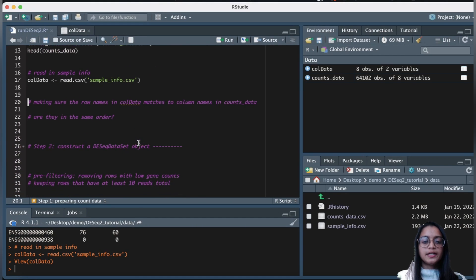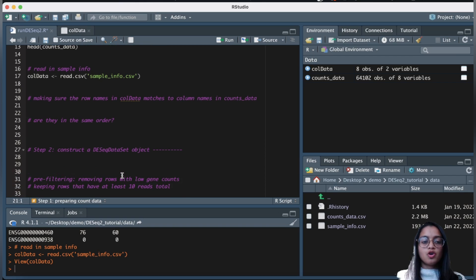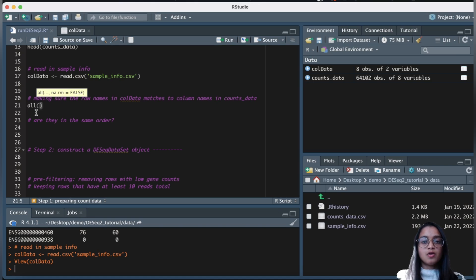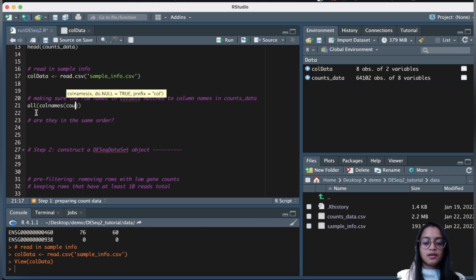Before we create a DESeq dataset, we have to make sure that the column names in our counts data match with the row names in our column data. They should also be in the same order, otherwise DESeq2 will throw an error. The first thing is to make sure that all the columns present in our counts matrix are also present as rows in our sample information.